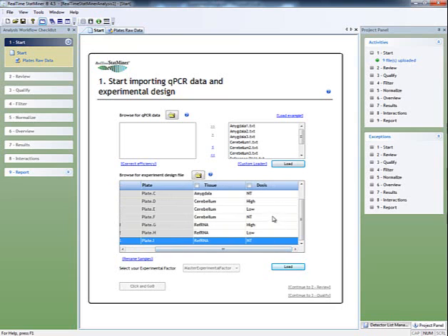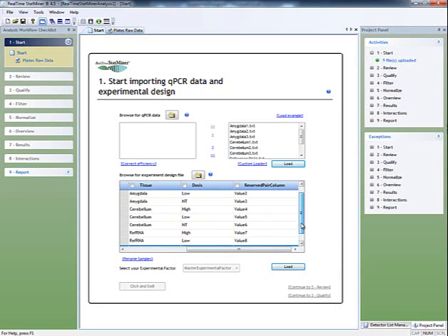There is also a paired factor option in cases where samples between biological groups are paired by another factor, such as time, and therefore we would like to perform differential expression analysis including this information in the statistical test. This factor is created in an equivalent way by assigning the same group or ID to those samples that are paired or have any kind of relation. If this information is defined, then StatMiner will automatically include it when a paired test is executed in the differential expression analysis.